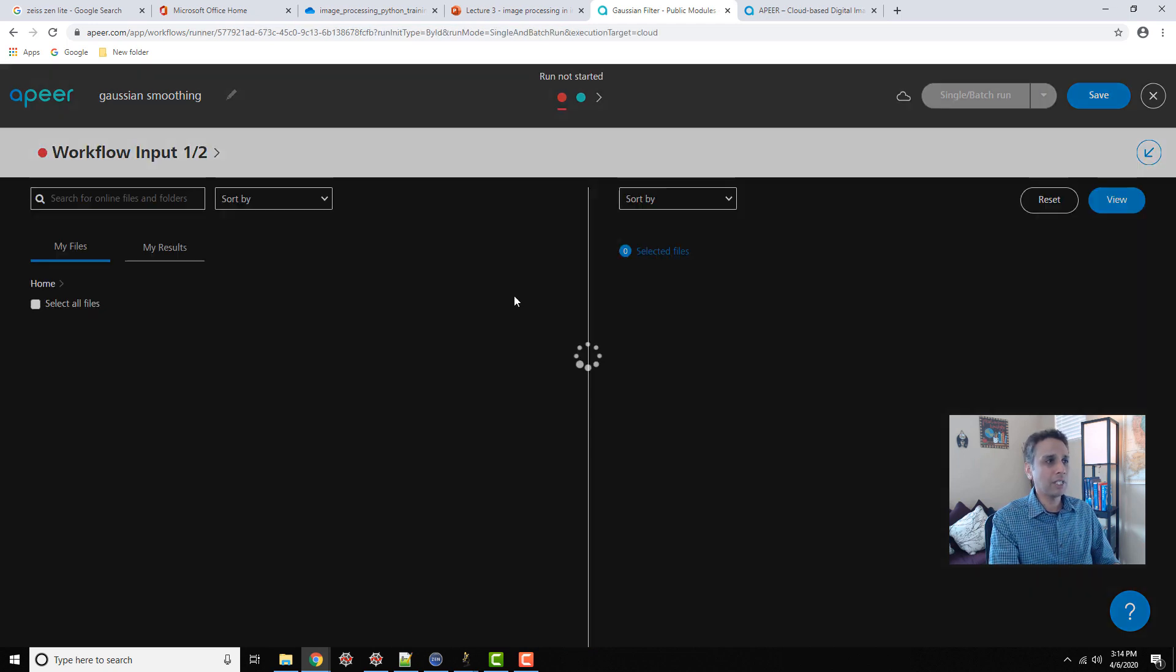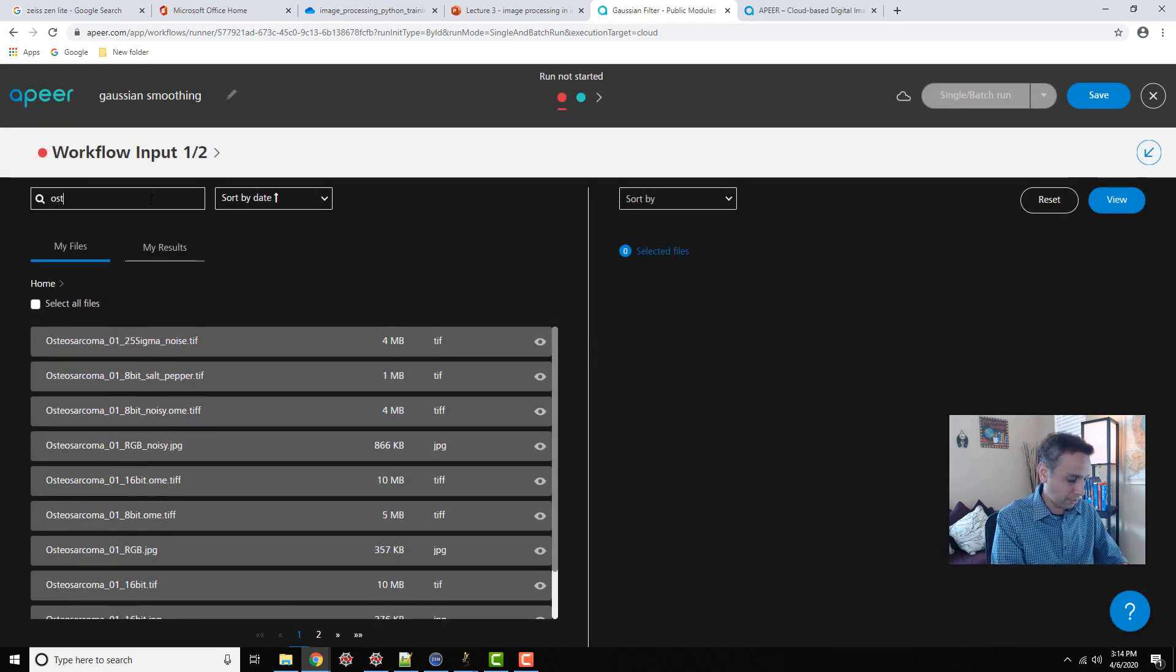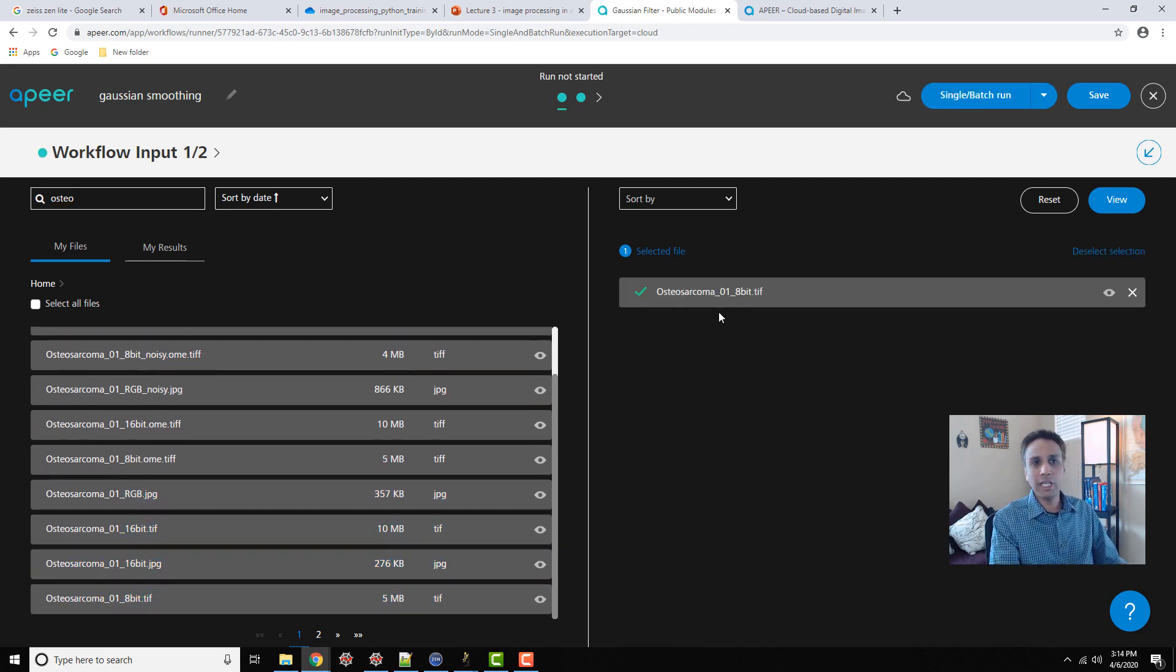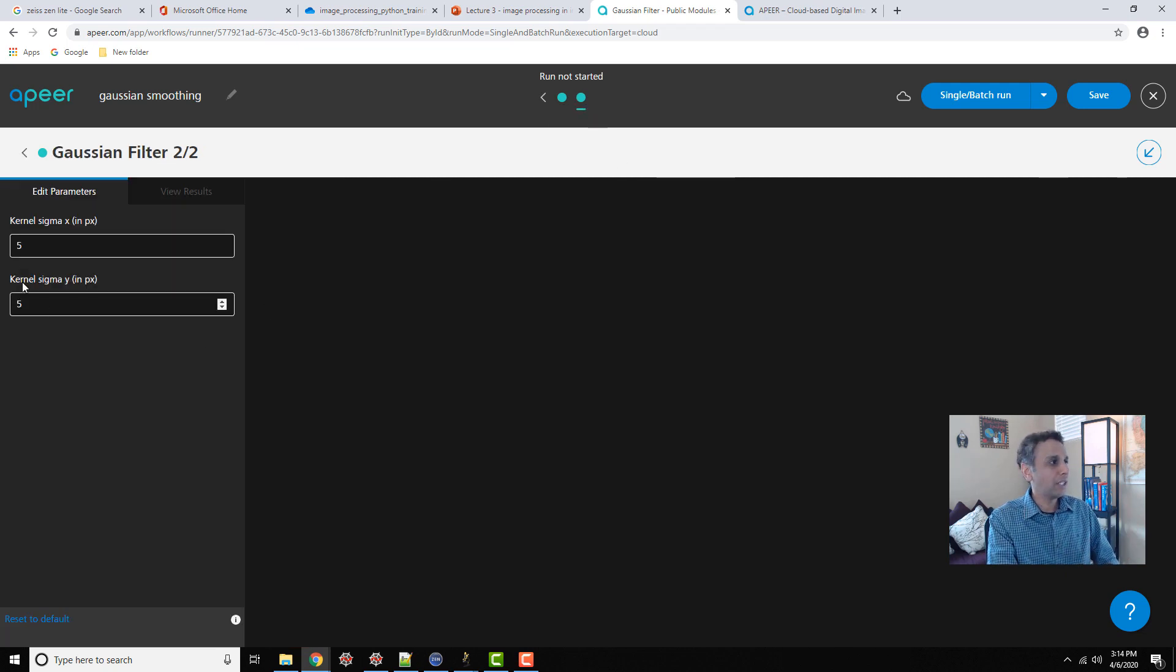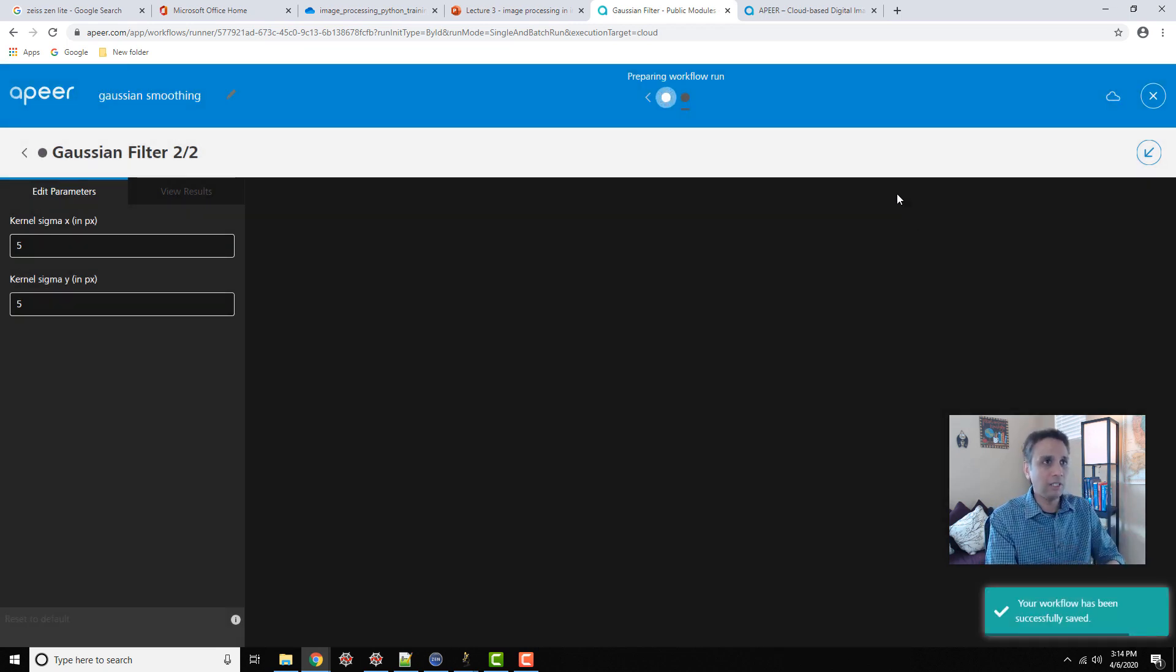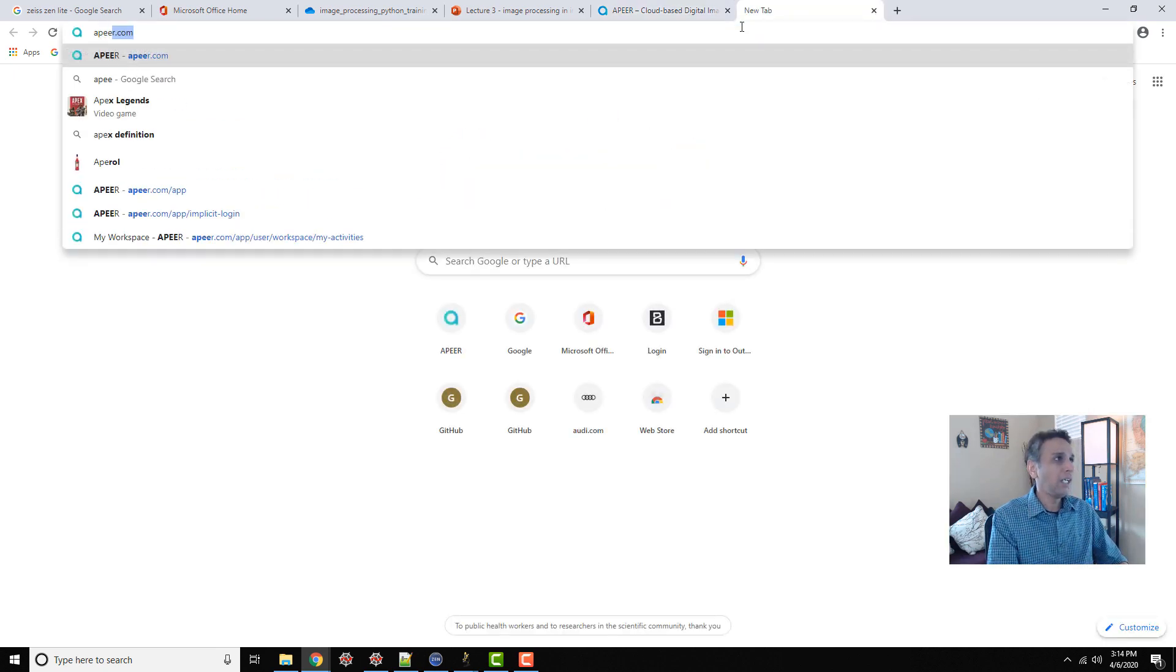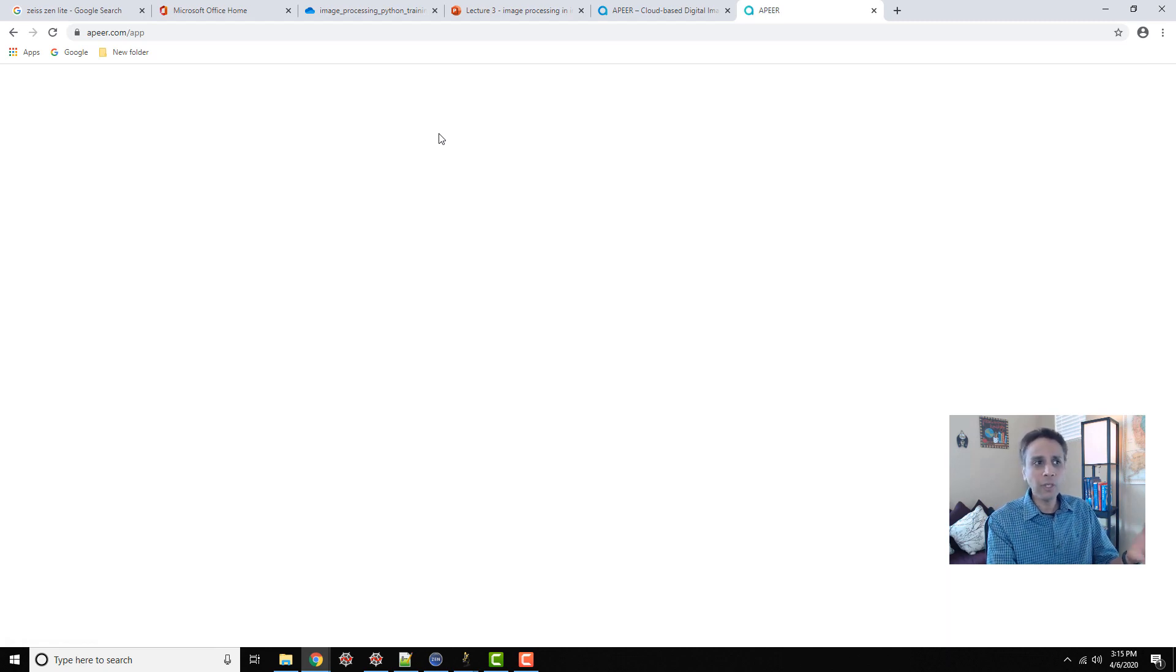So once you have this workflow, just define your input image. I believe I already have my osteosarcoma as part of my account. Everyone gets 100 GB of free storage. So osteosarcoma, 16-bit, 8-bit, there you go. You can add any number of images for batch processing. For Gaussian filter, let's leave a kernel size of 5 and 5. Go ahead and start it, and this runs in the cloud. You don't have to do anything. In fact, you can even close the browser, and the workflow still continues. If I log on to my Apeer account, I should be able to track it.